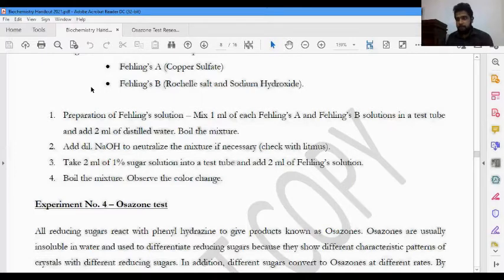What can you say? Red litmus turns into blue color. Yes, as you mentioned very correctly, red litmus paper will turn blue if it is slightly basic. And if we do not have red litmus in our laboratory, we can use blue litmus. Then blue litmus remains blue.